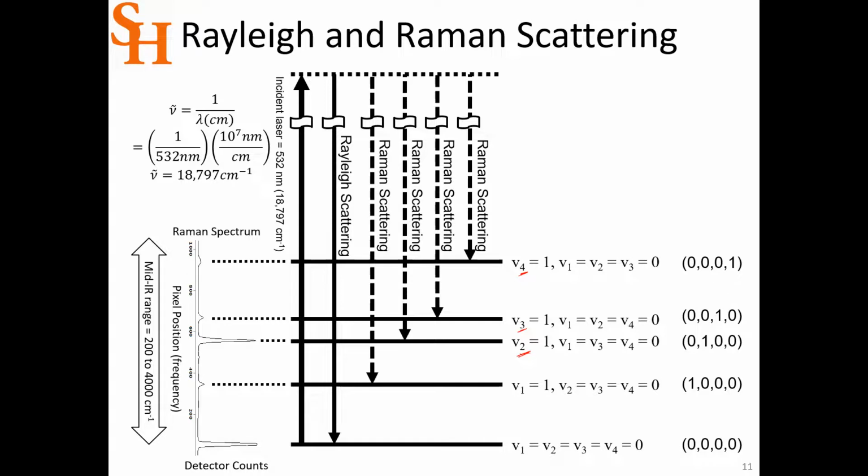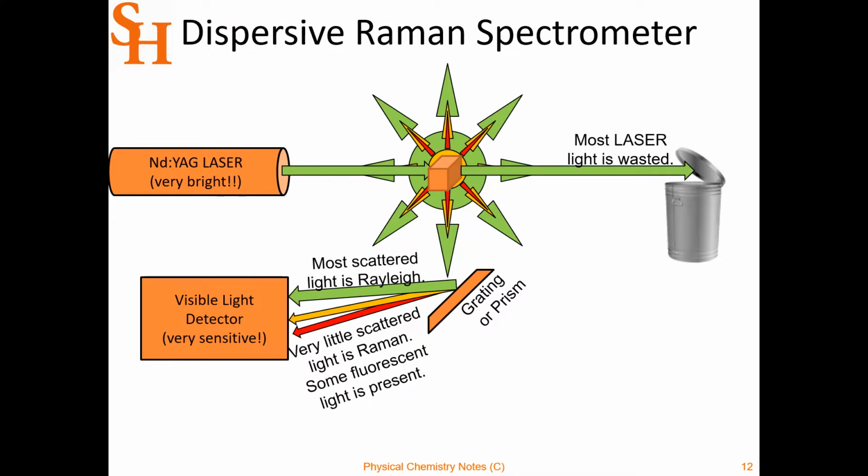Okay, so we can simulate the Raman spectra that way and the IR spectra. So I've cleaned that spreadsheet up and put it on Blackboard so you can just download it, and you'll see it will look familiar, but it'll be slightly different. But it'll look familiar in general terms to what you did for a particle in a box. So that's why I was kind of out of my office last week. I was preparing the new and improved lab section handout for this week's lab and then making that spreadsheet for you. All right, so let's look one more time at the instrument.